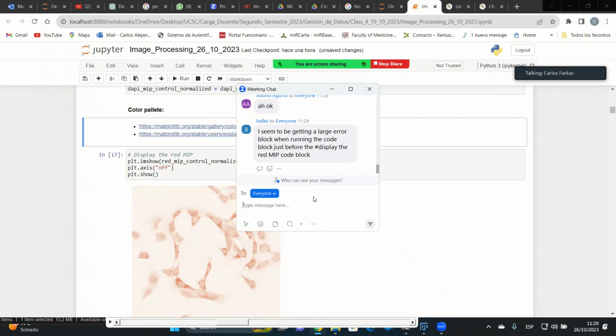Oh, can you send me, Stefan, the error you had, in the chat or for everyone? Oh, when you change the color, that happened?